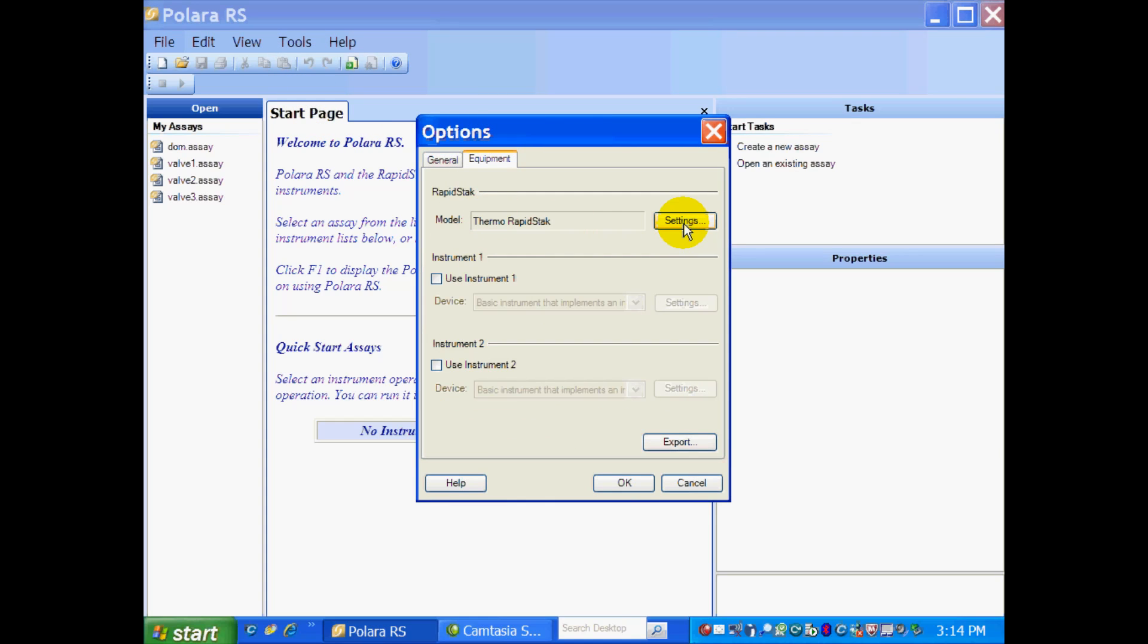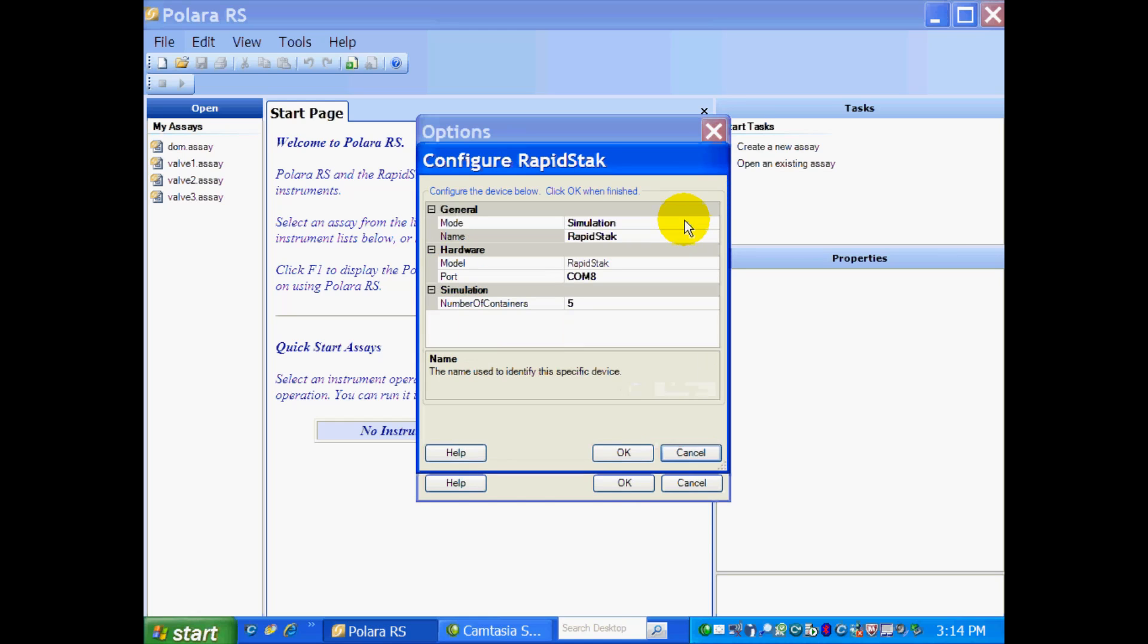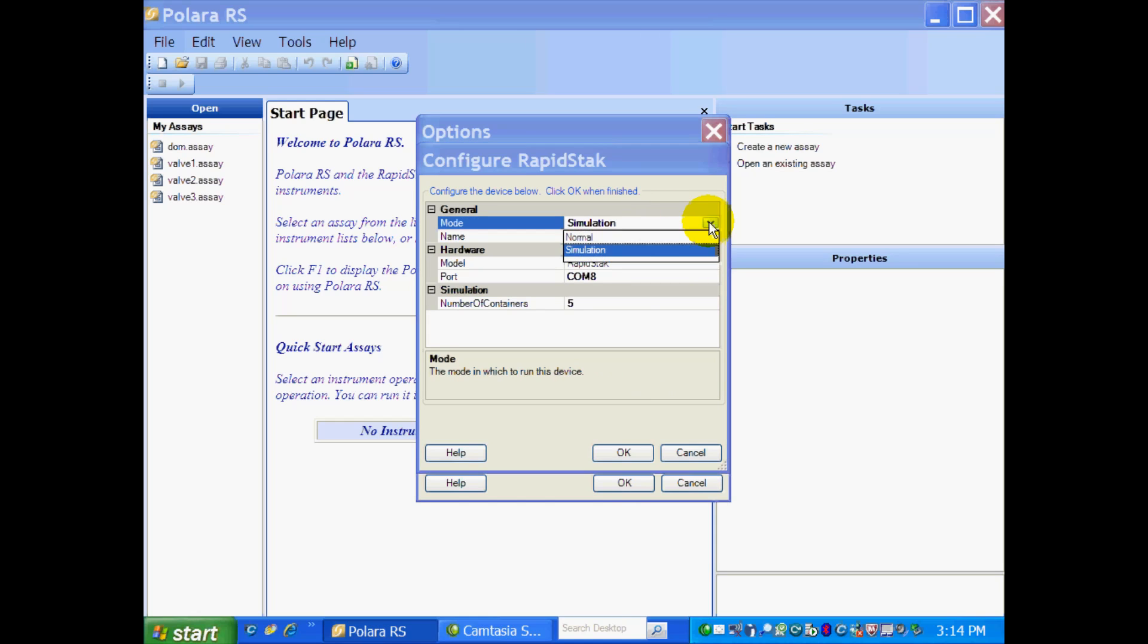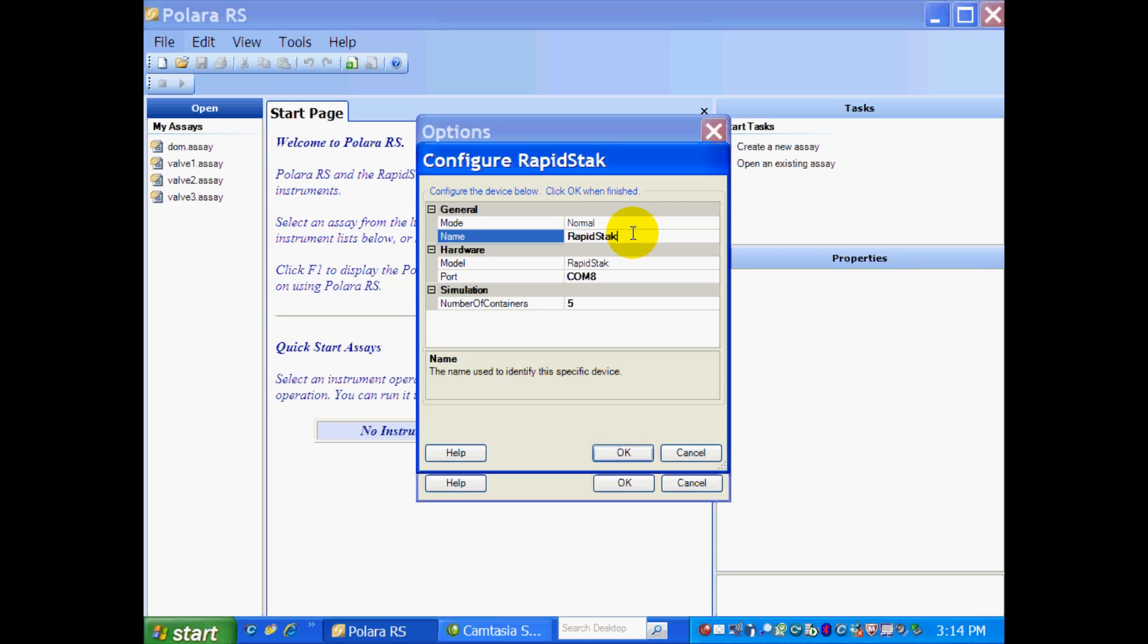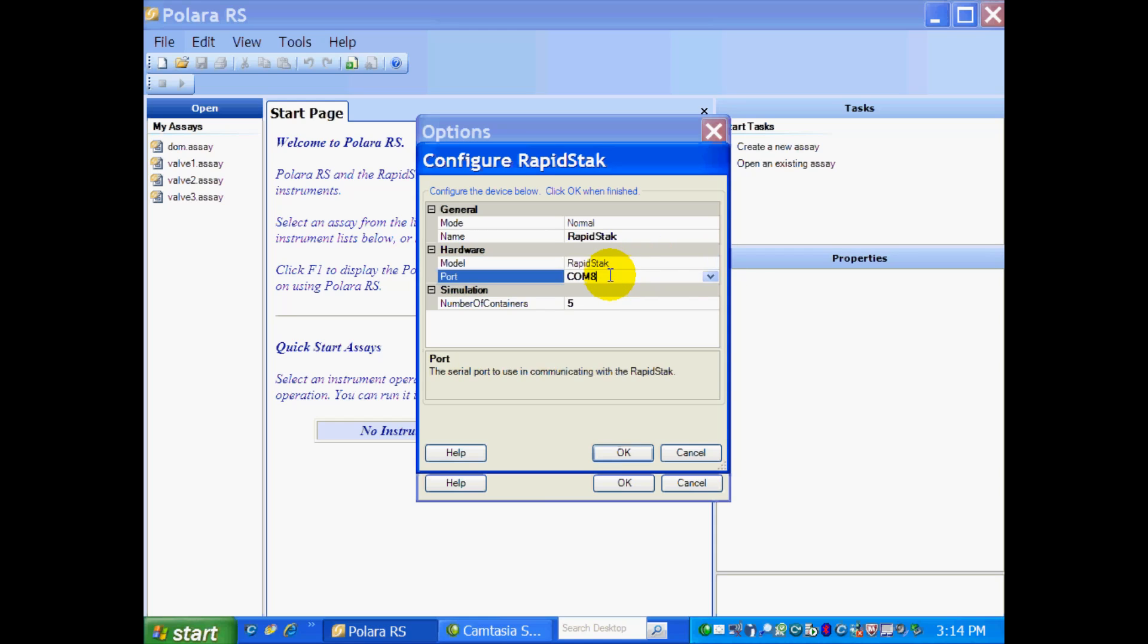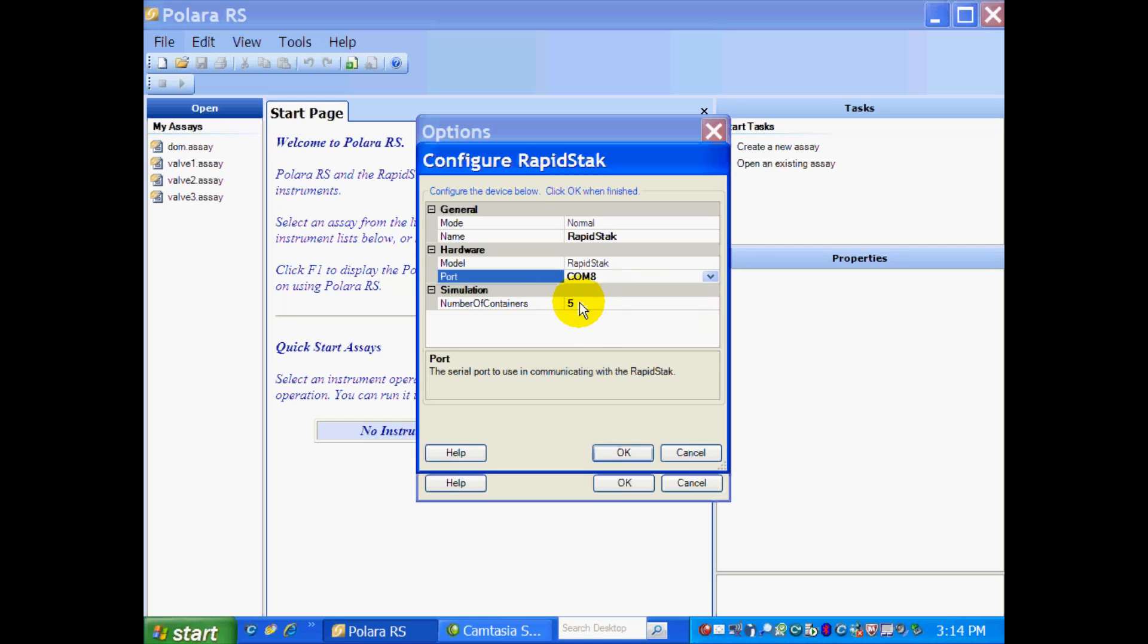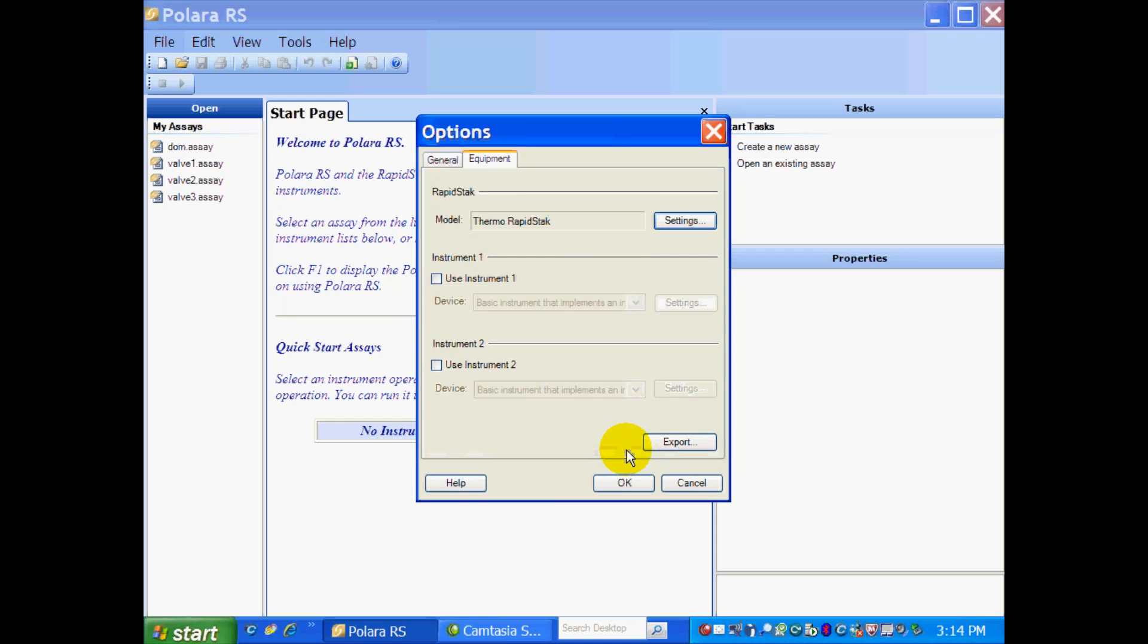First thing we'll do is check the settings of our RapidStack. First of all, we need to be in Normal mode, not in Simulation. We've given our RapidStack a name, which is RapidStack. I'm using just a standard RapidStack, not a 2X, so I select that model. And I have to identify the COM port that my RapidStack is on. I know that my RapidStack is on COM8. And all I have to do is select OK.